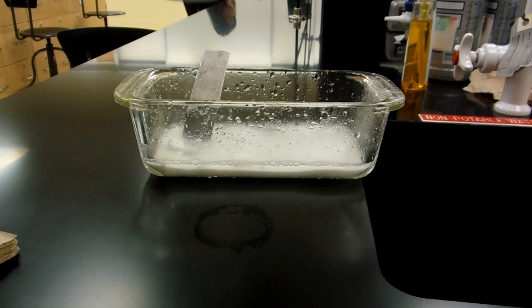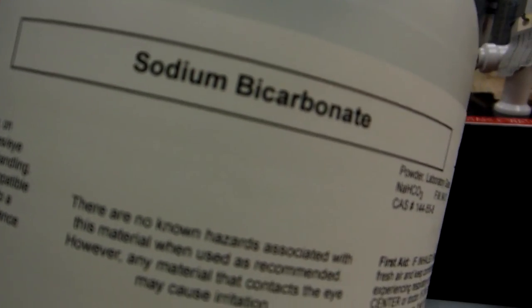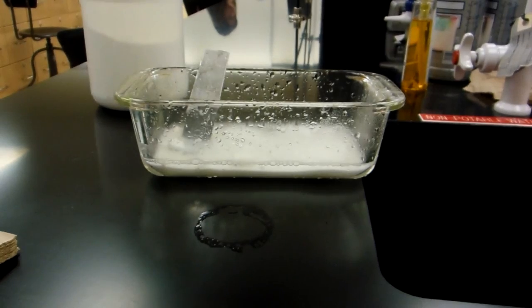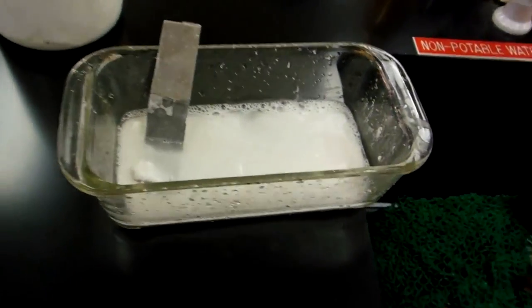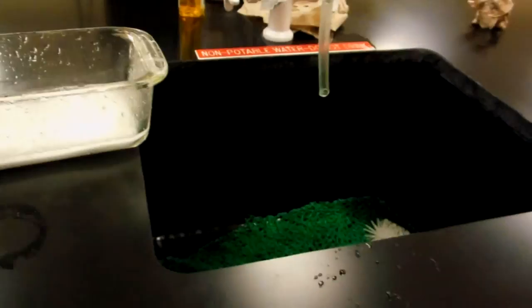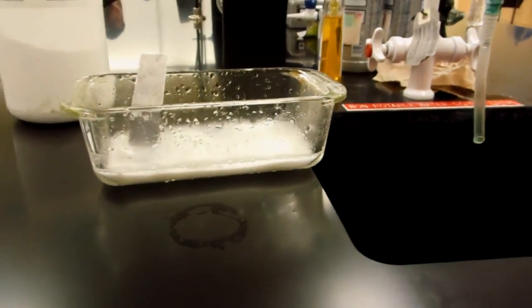So now I will neutralize the acid present in the filtered solution in an aluminum sheet with some more baking soda, known as sodium bicarbonate, according to the label. So you can see my bath here with the aluminum and the filtered liquid. So we'll move on to the next step.